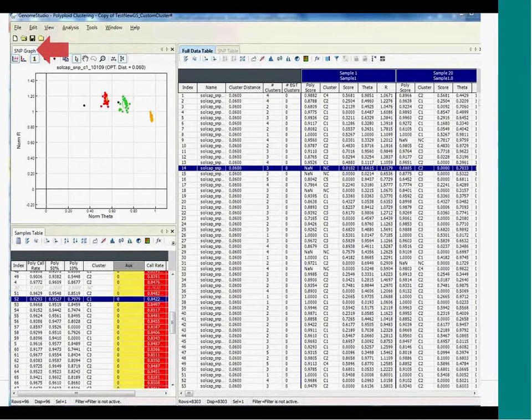Poly 50% is a column that is used instead of the P50GC that some folks may be familiar with from the genotyping module. And poly 10% is the column that gets updated instead of the P10GC. Poly 50% and poly 10% are the 50th and 10th percentile, respectively, PolyScores for all SNPs within the samples table, or for all samples within the SNPs table. PolyScore can be thought of as a PC module proxy for GenCall score. So it ranges between 0 and 1 and gives a relative confidence that a sample has been accurately assigned to a cluster. We'll talk more about this later.